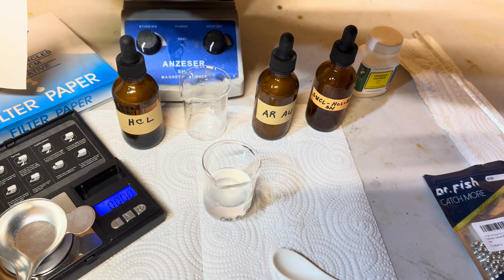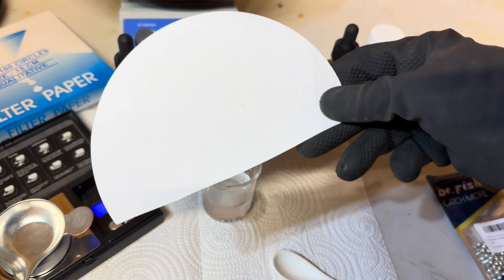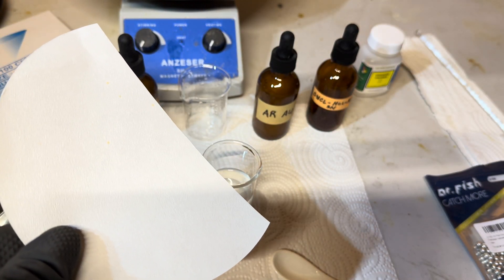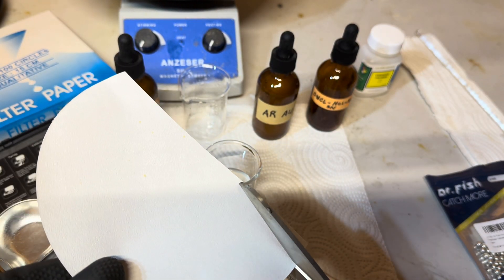As we let our solution settle for a few minutes, we will take this opportunity to cut up some test strips of filter paper to test our aqua regia and stannous chloride.